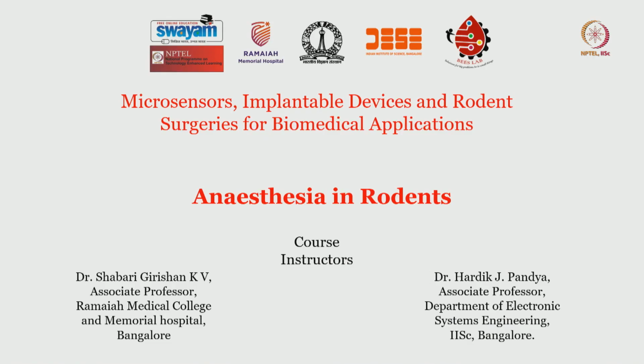It's very important to understand how and what sort of agents need to be administered, what the risks to the rodent's life are because of those drugs that we are using, and what methodology you need to employ which is suitable for your own experiments.